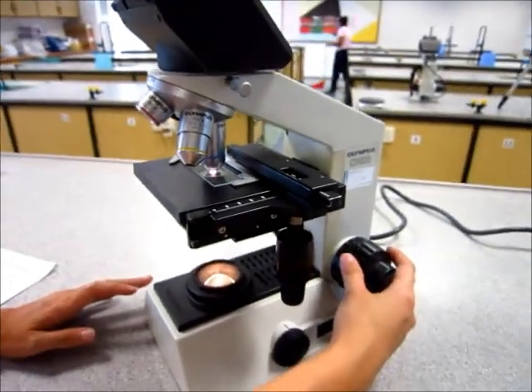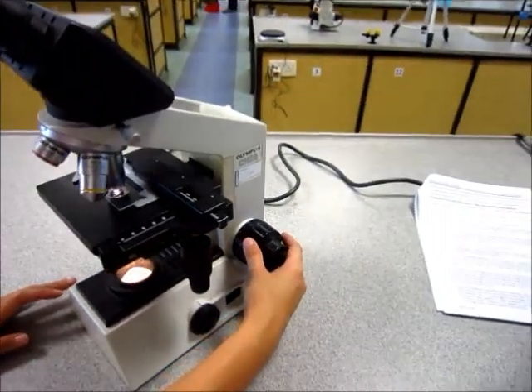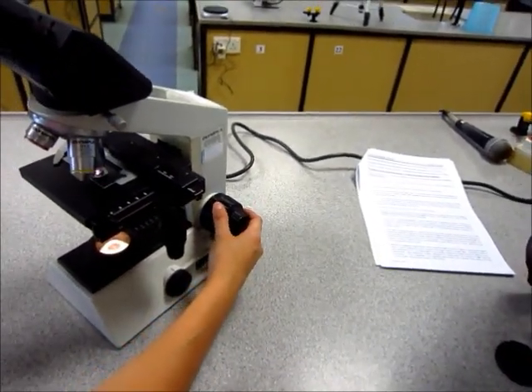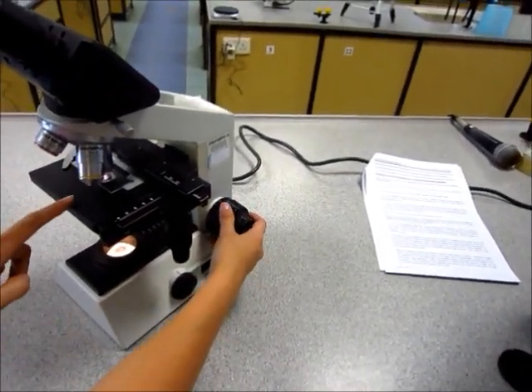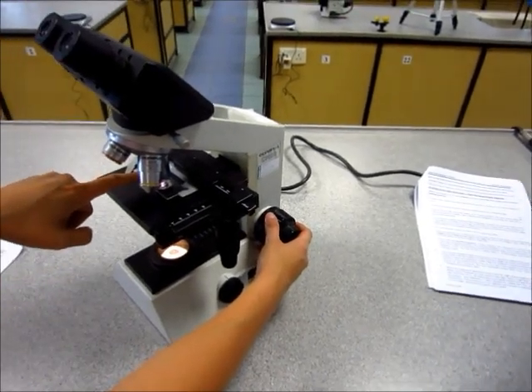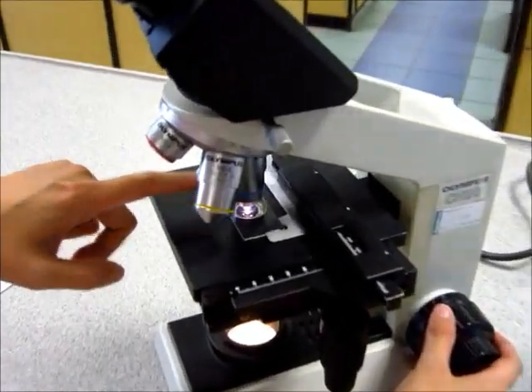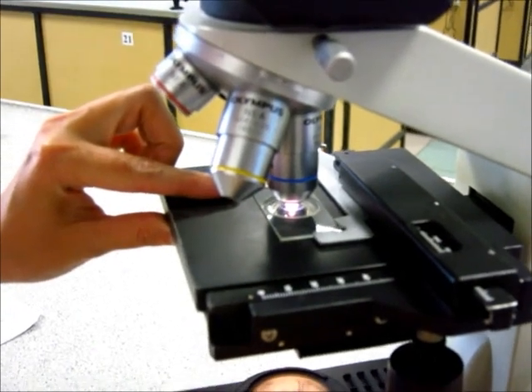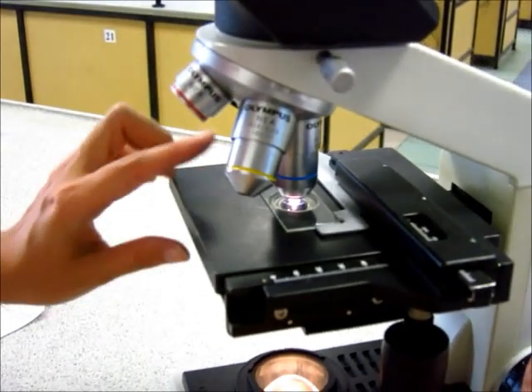If you want to adjust using the coarse adjustment knob, you should take your eyes off the eyepiece and look at the stage, just to make sure that the objective lens doesn't come crashing into your slide and breaking the slide. So we don't want that to happen.